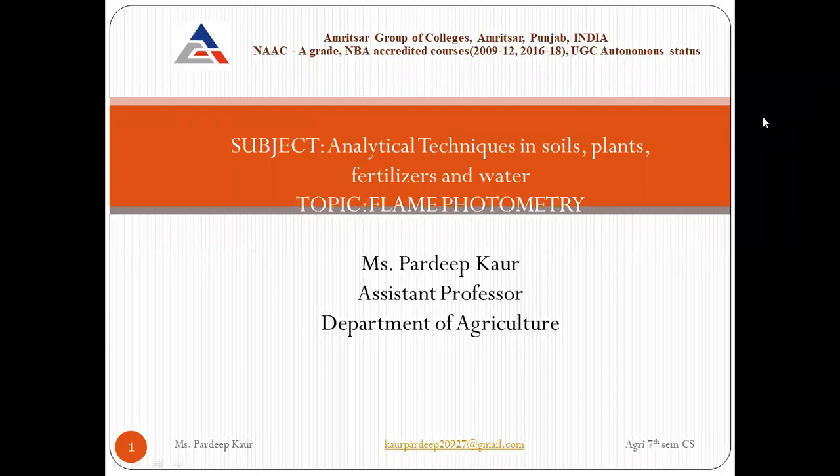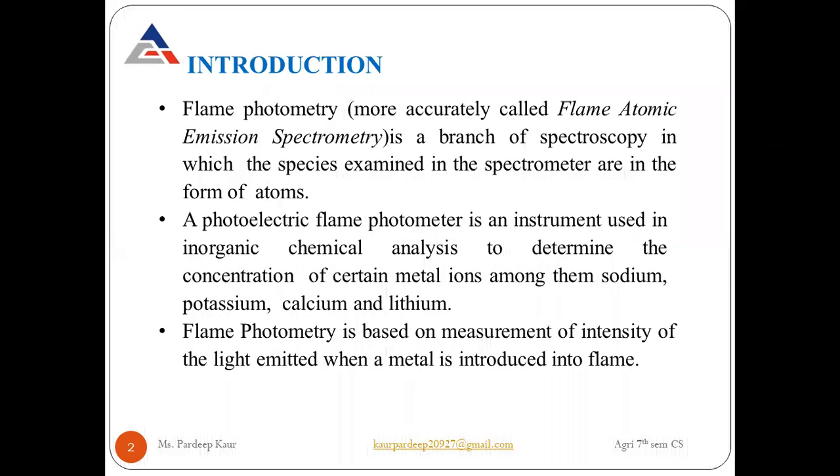Morning, students. Today our topic is flame photometer. So we will study about flame photometer in detail. First is a brief introduction about flame photometry.